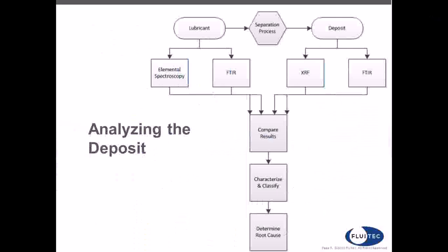You can, through a physical process or a filtration process, separate out the deposits. You can use a solvent extraction or a chemical process. But ideally, you want to have a lubricant to analyze and the deposits to analyze.